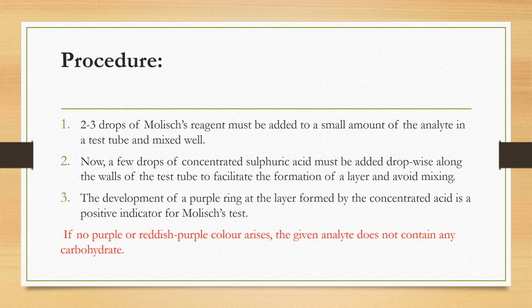Try to avoid mixing, to facilitate the formation of the layer. When you add sulfuric acid, don't mix, just wait to observe the formation of the purple ring.